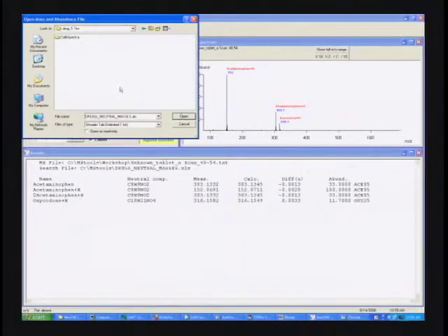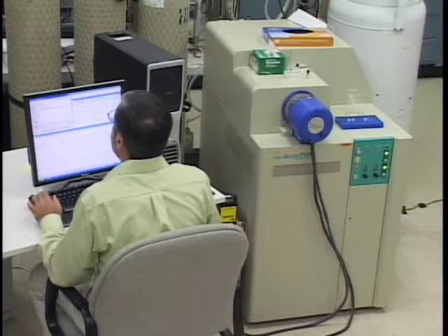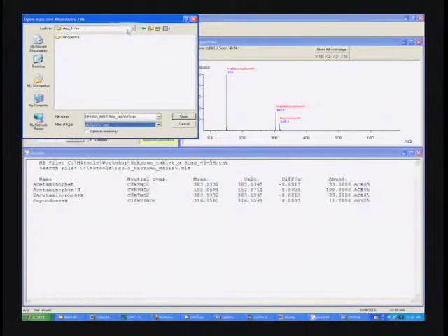And that apparently wasn't where we put it. It's a project. It's looking for JEOL, it's looking for Shrader files.